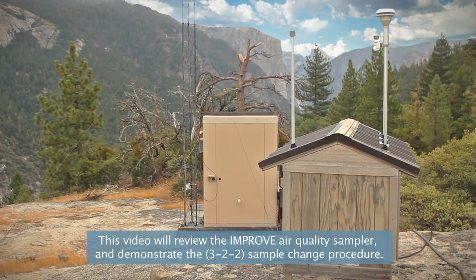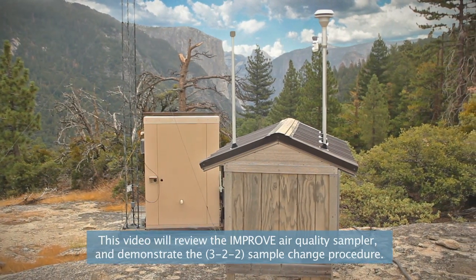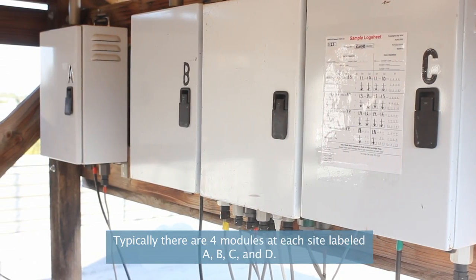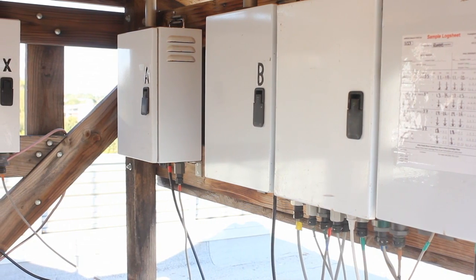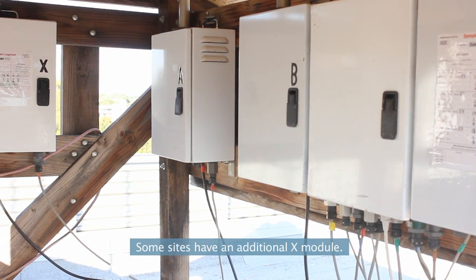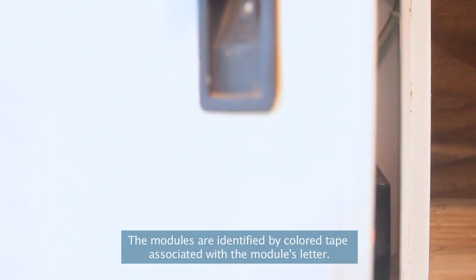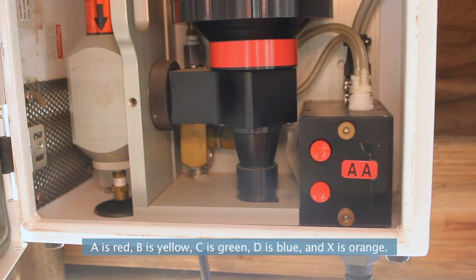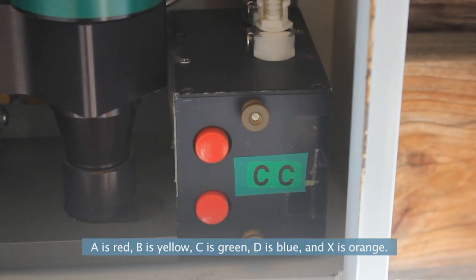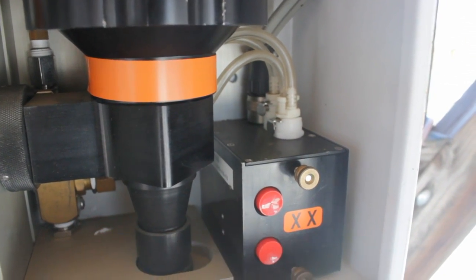This video will review the Improve Air Quality Sampler and demonstrate the 3-2-2 sample change procedure. Typically, there are 4 modules at each site, labeled A, B, C, and D. Some sites have an additional X module. The modules are identified by colored tape associated with the module's letter. A is red, B is yellow, C is green, D is blue, and X is orange.